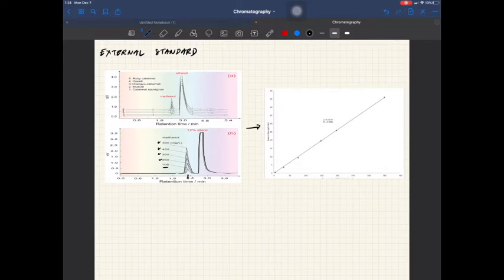As you can see, those that have lower concentration tend to have lower peak height and peak area. So we can either choose peak height or peak area. But in chemical analysis, what is often used is peak area. Upon integration of this peak, we can determine the peak area. So suppose for 100 ppm, we have 200, 300, 400, 500. This is the concentration of the standards.